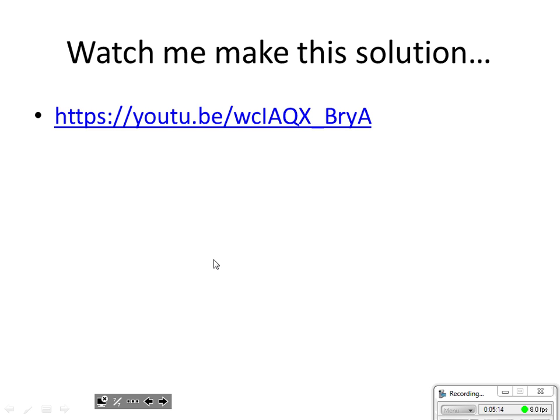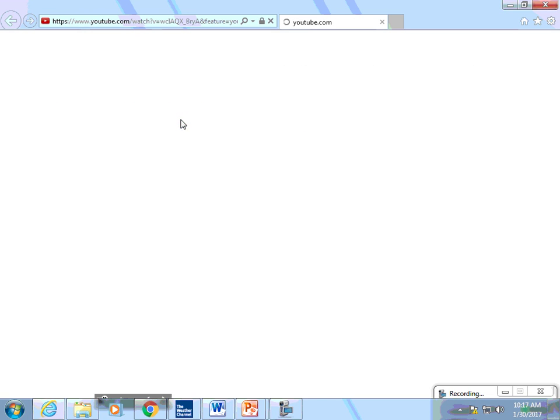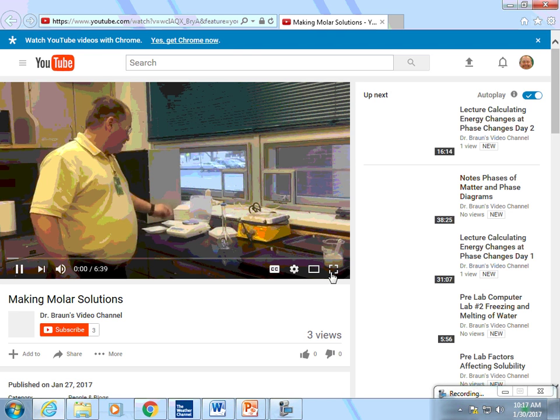Now here we're going to go. I have created a video of myself making this solution, so we're going to go to this video and we are going to watch the video of me making this solution. So here's the YouTube video.